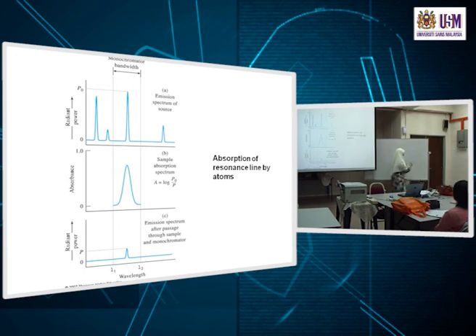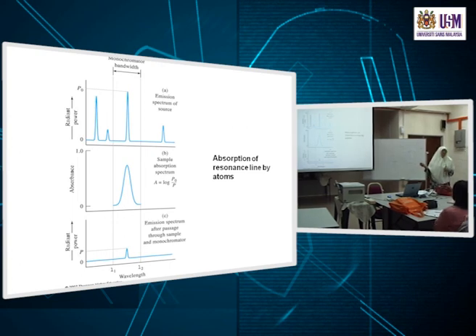How does light come out from a source? The electron must undergo a transition from a higher energy level to a lower energy level and give out light. That's how you get this light. So in that source, excitation must have occurred first. If you don't jump up, how can you jump down? So electrons must be excited first, then when it drops, relaxes to the ground state, only then it gives out characteristic lines. So these are the radiation given out by a certain source. Let's say it's copper, so it's copper lines.